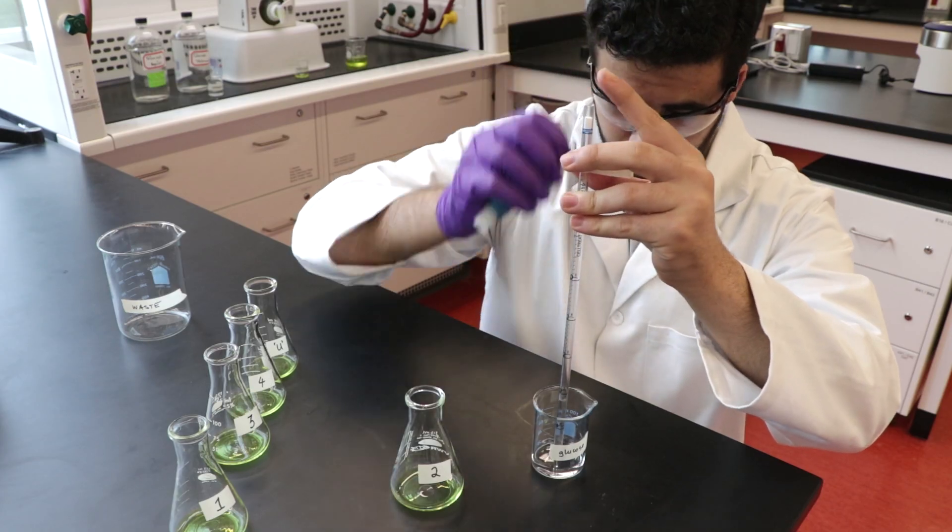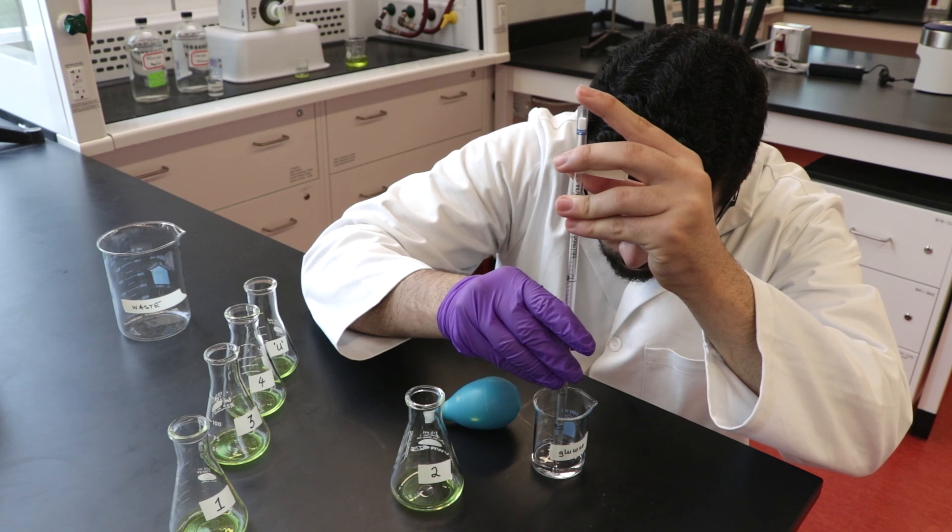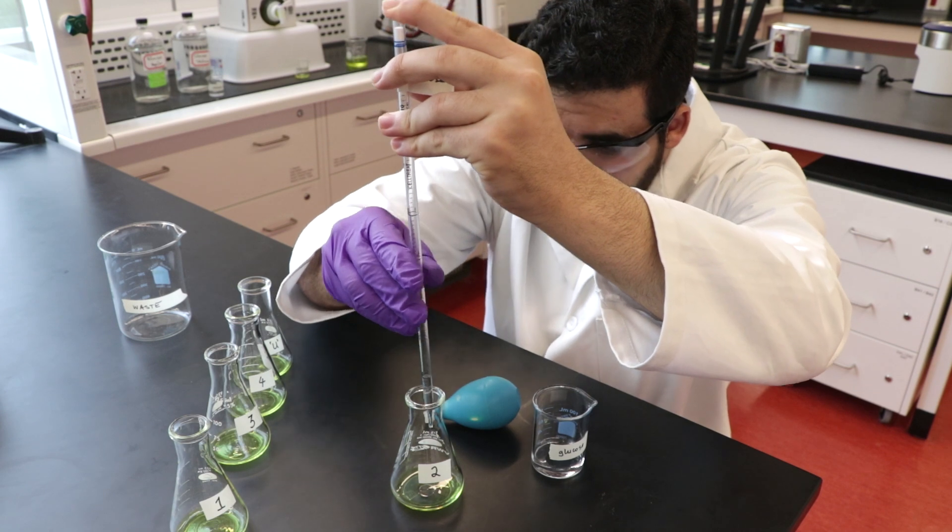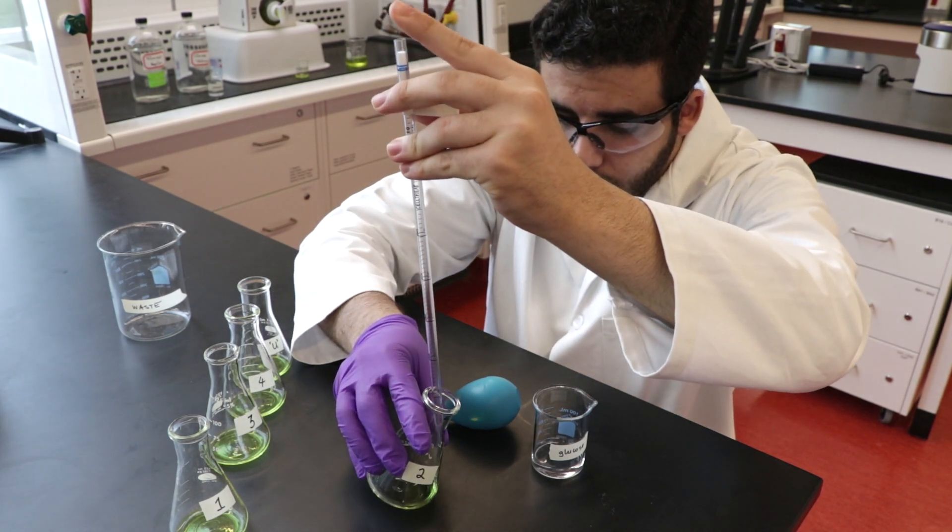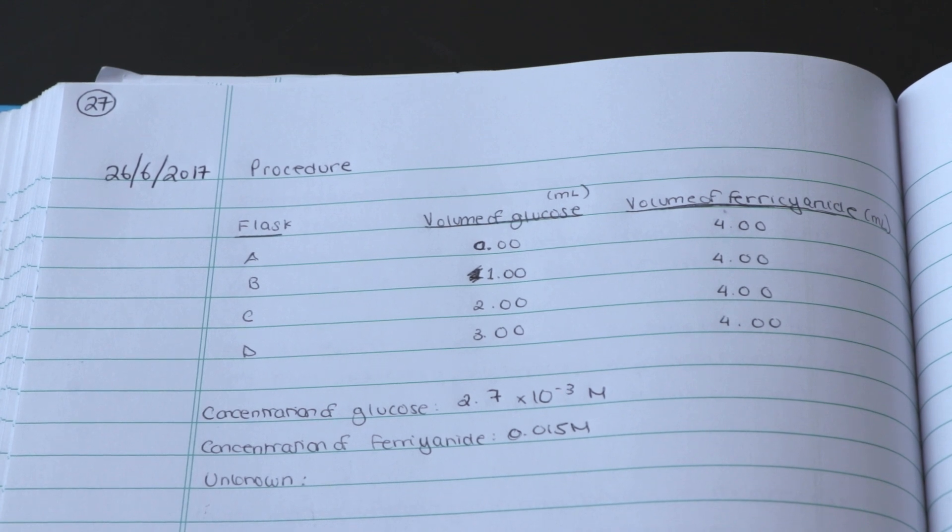Then, using a mohr pipette, transfer the appropriate volume of glucose into the Erlenmeyer flasks according to the values indicated in the lab manual. For example, 1 mL of glucose is pipetted into flask 2. It is good practice to transfer the table of values into your lab notebook.